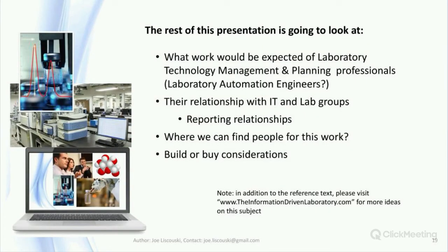During the rest of this session, we're going to look at the points noted on the screen. The basic premise is one that has been noted earlier in this series. Our ability to effectively use laboratory systems is going to depend upon having qualified people to plan and implement them. We have to put the idea of implementing lab technologies on a case-by-case basis behind us and look at lab operations as a whole. How are we going to meet the lab's needs?